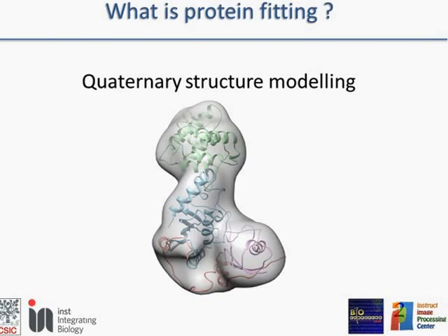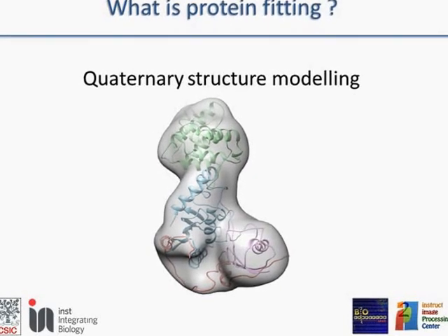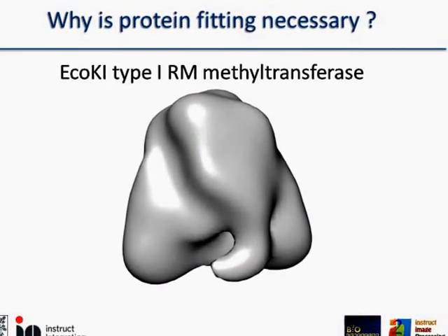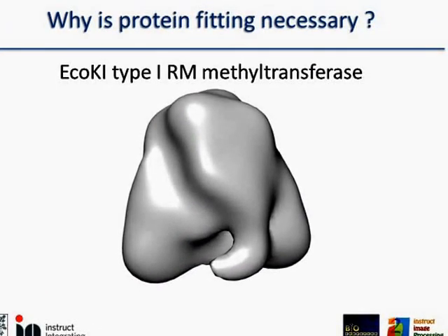And this is the difference with docking. In docking we don't have this information, the information of volume.